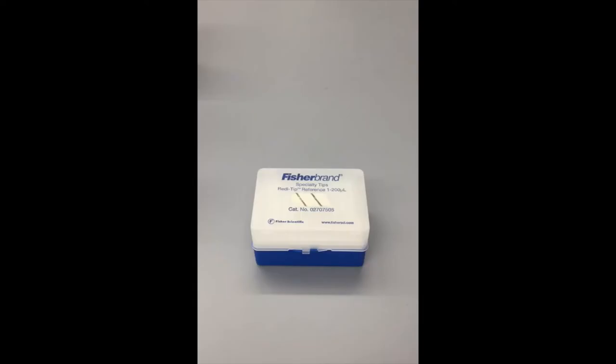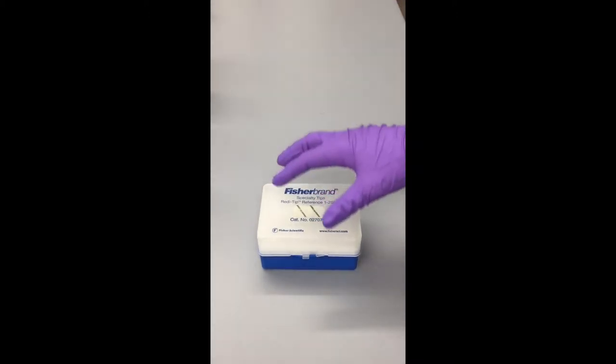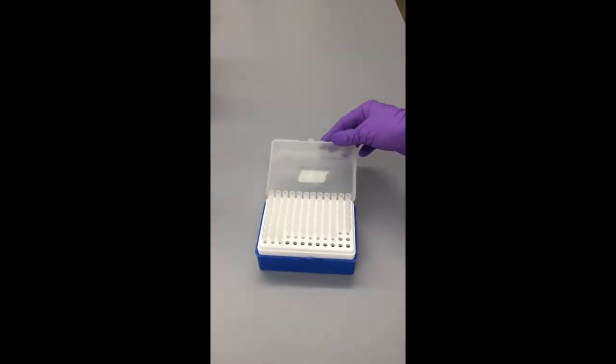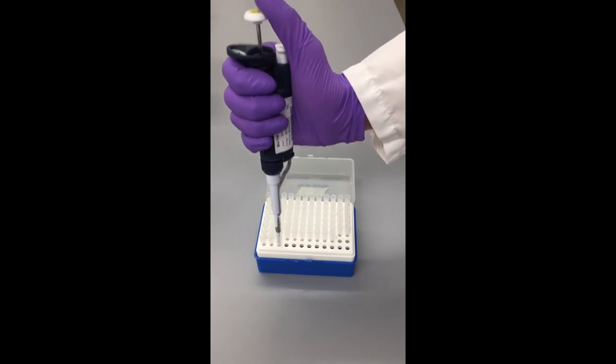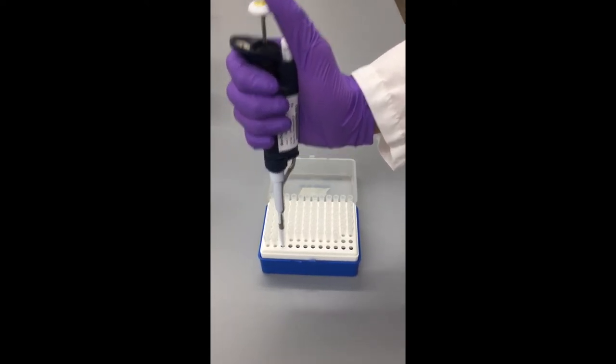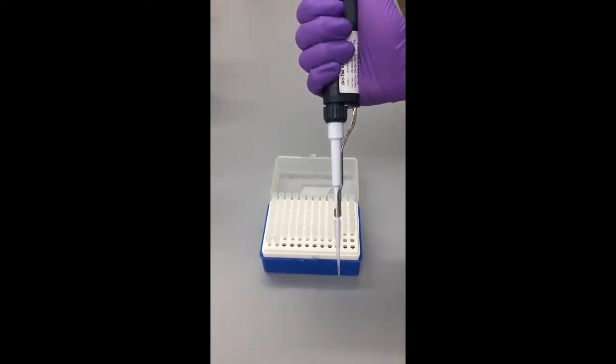This is a micropipet tip box. It contains several tips. Depending on the size of the micropipet you are using, the size of the tips you will need will vary. To attach the tip to the micropipet, simply open the box, stick the micropipet into one of the tips and apply some pressure. Tap the micropipet against the box a few times to ensure that the tip is securely attached.